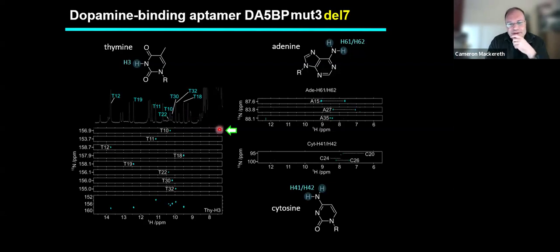And one thing that was interesting is during our synthesis, sometimes if we've had these isotopic phosphoramidites around for too long, they sometimes degrade a bit, they sometimes don't work as well.